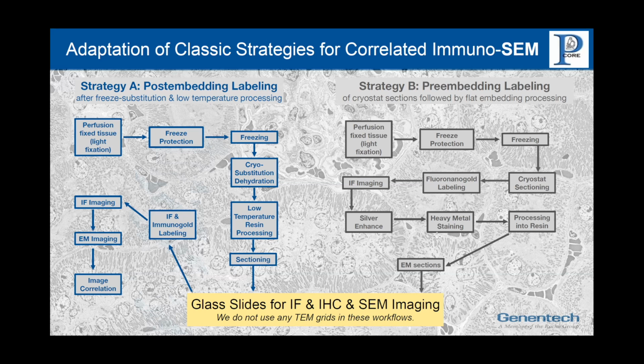Importantly, what both of these strategies have in common is that I used essentially classic protocols, but adopted and modified them in a way that they are fully compatible with having the whole workflow on glass slides instead of using any TEM grids in the workflow. And so let me go into a little bit more detail.